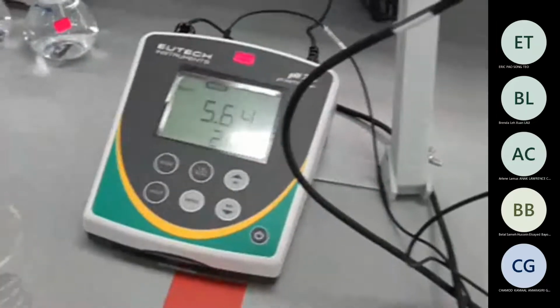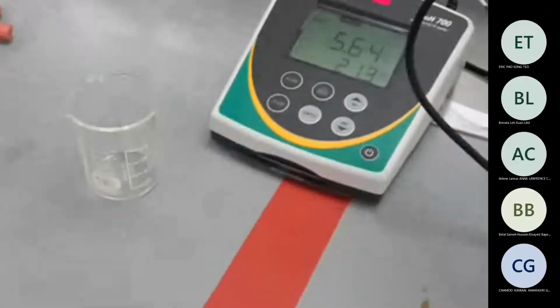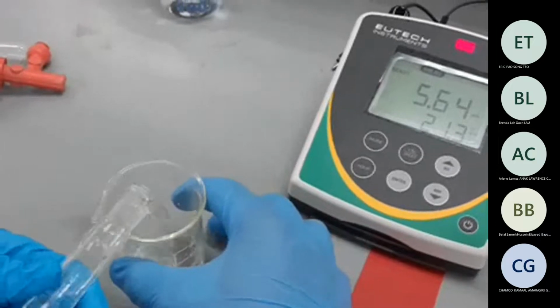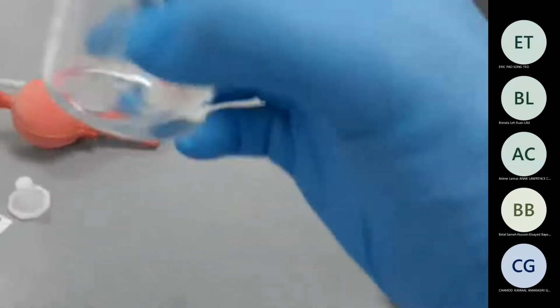Okay, so let's say for HCl, we take the HCl first. We take a little bit and rinse the beaker with this. Since it is very diluted HCl, we can just leave it here for the time being.